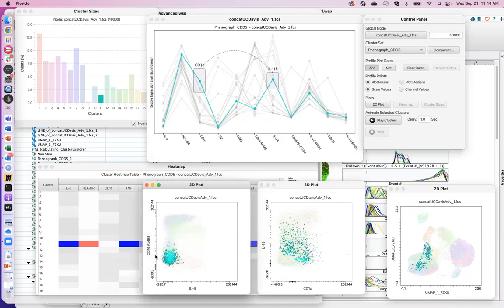And you can see that this population is negative for both of those markers. Okay, but IL-12, I think, is popping up over there. So let's see what it means by mid-expressing of IL-12. Okay, maybe a little bit, mostly negative, but there are some cells here on the periphery that are probably positive. So again, we could overfit the model a little bit more to try and tease apart this population of cells over here away from the bulk. But in any case, you can see those cells presented to you.